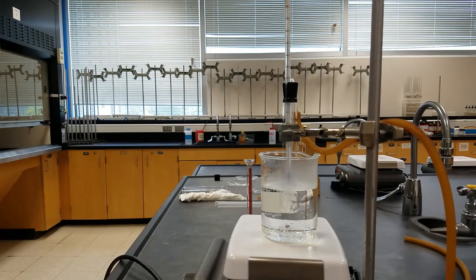You will be provided pictures of the thermometer for your liquid unknown to determine its boiling point. Thank you.